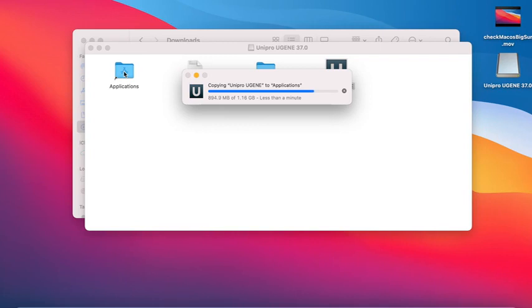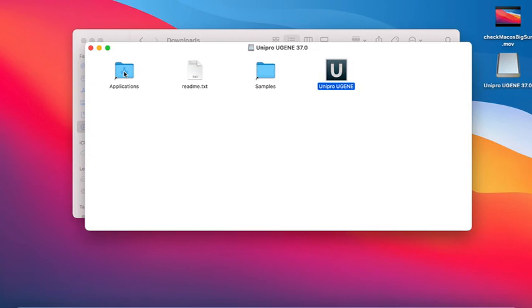We're now 4 minutes into our installation. Getting there. And there we are. So right now it's all installed.